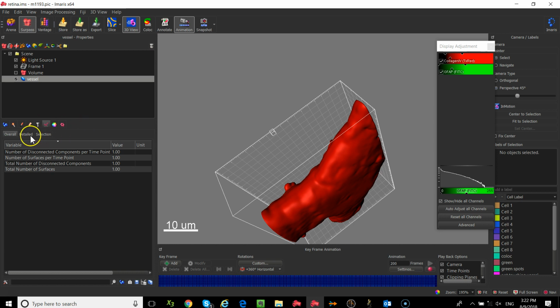Okay. So one other tab I want to show you is one called Detailed. So by default, when you go into statistics, it shows you a count. The overall tab is for counts. If you go into the Detailed tab, it gives you a list of objects that it has found. Now, I deleted all the other objects, so I should only have one statistic.